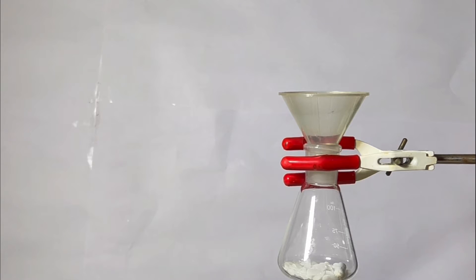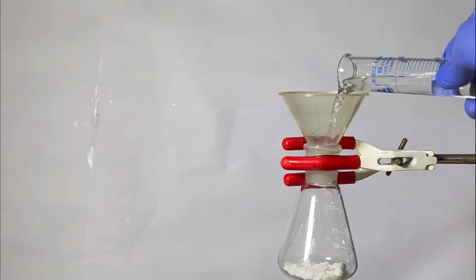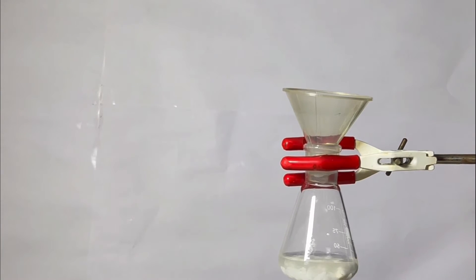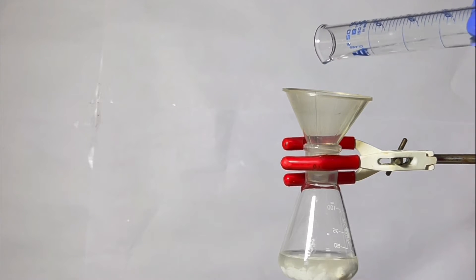Next, 40 milliliters of methanol was added to the flask. Some amount of methanol from the 40 ml volume was used to rinse any leftover sodium hydroxide present in the beaker, and that too was transferred to the flask. Then the remaining methanol was used to wash down everything to the flask.